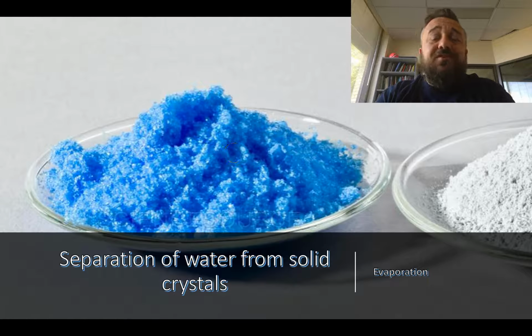G'day chemists. So today we're going to look at a particularly special type of evaporation for separating mixtures. A lot of the times we'll have hydrated salts or ionic crystals that have water embedded into the crystal lattice structure. Now, what makes this really interesting is that we can separate out the water in exactly the same way. We can just evaporate it out, and it'll go straight from that sort of solid locked in to a gas being evaporated out. One of the really common examples is copper sulfate.